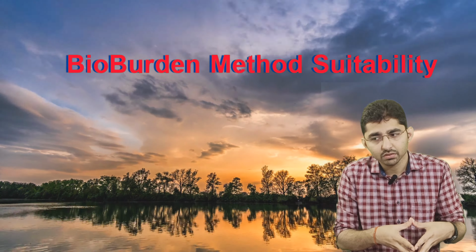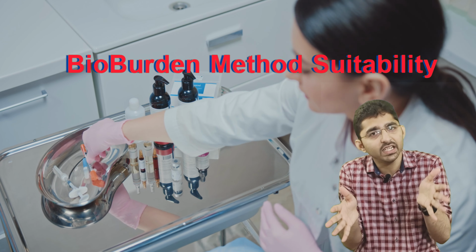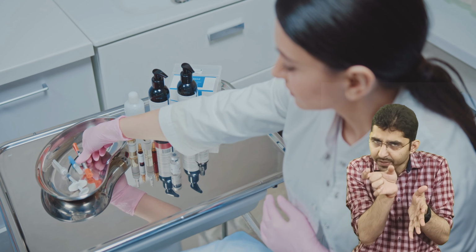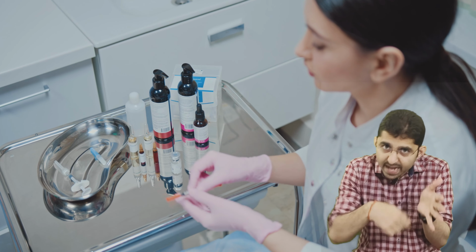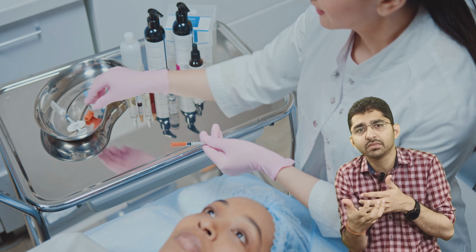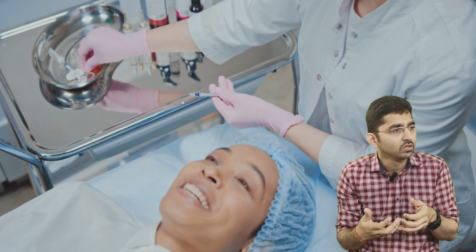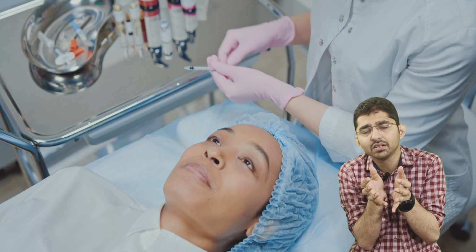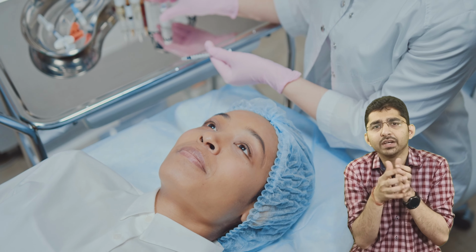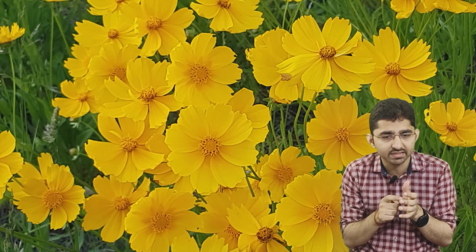So let's say you have done a bioburden test, there is a series of data available. So a particular data point which spikes the bioburden test. I mean, let's say there are 5-6 types of microorganisms on that medical device which are viable in nature. So among those 6 organisms, there could be a probability that one of the organisms will show a spike in the bioburden value, I mean the bioburden test. That is called a bioburden spike.